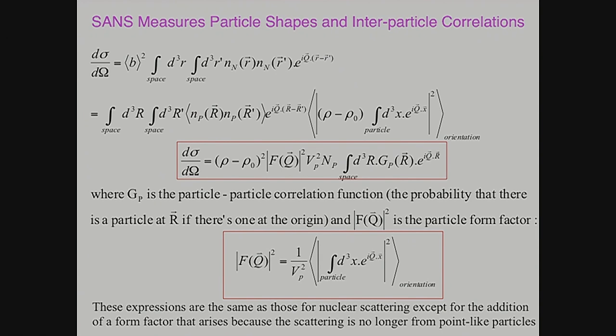There's a lot that I pushed under the rug here. Most people who do small-angle neutron scattering will assume that it's all elastic scattering and that there's no inelastic scattering, there are no excitations. For most of the types of experiments, like, for example, a colloidal particle in D2O or a polymer blend, you assume you're measuring a static structure. Now, to be honest, small angle scattering has in the past been done at reactors. There's no way they can tell whether it's elastic or inelastic, because they just take the neutrons going in and measure all the neutrons coming out and assume that they're elastic. That's not true if you do it at a pulse source, because you have the timing information so you can tell.